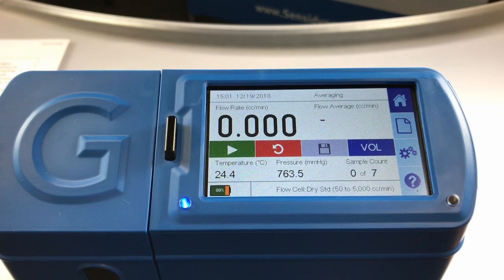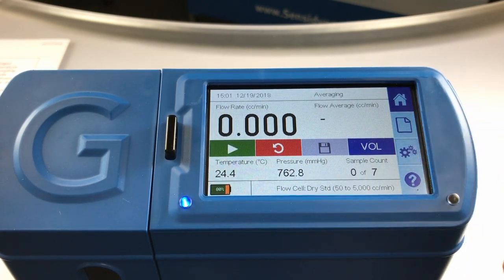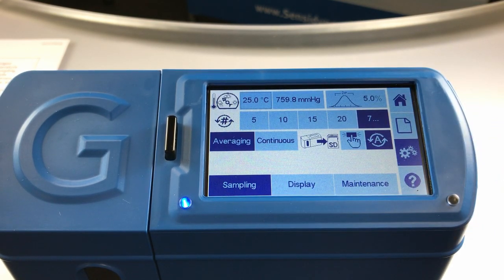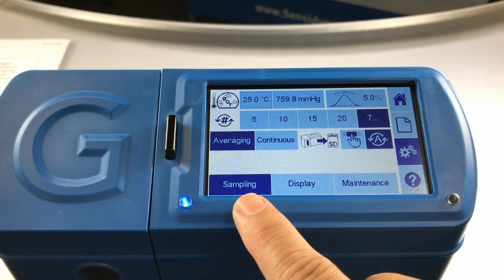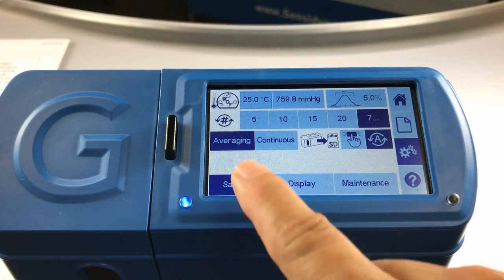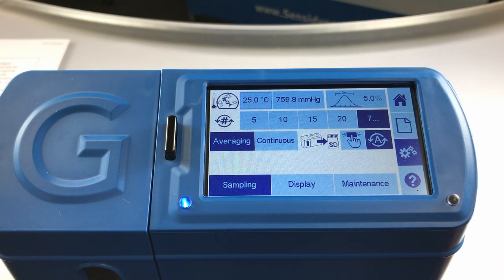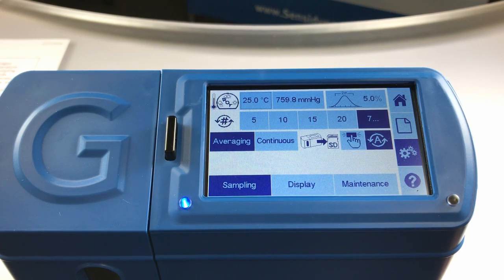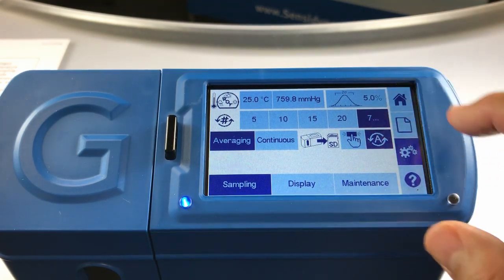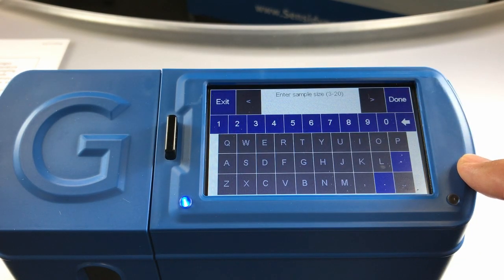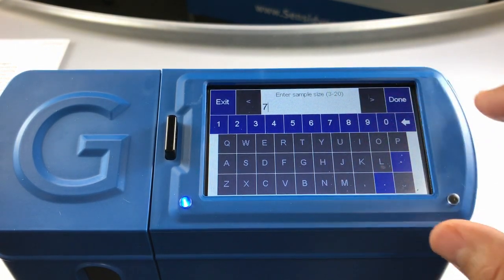To configure your Gilibrator 3 unit, select the settings icon on the menu bar from the home screen. The sampling tab is the default screen and should be shaded blue at the bottom of the screen. Select either averaging or continuous mode. In averaging mode, you will need to select the number of samples you wish to have. For quick selection, you may choose a preset value — 5, 10, 15, or 20 — or select a value in between by pressing the last button with the three periods. For the purposes of our demonstration, we will select seven samples today.